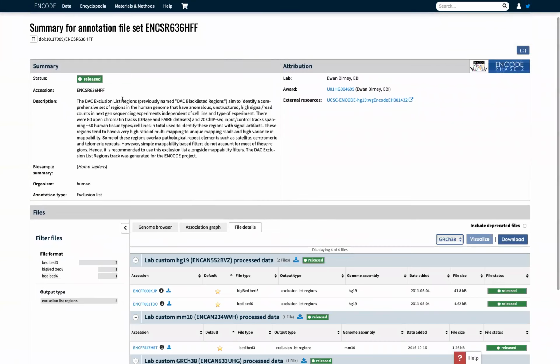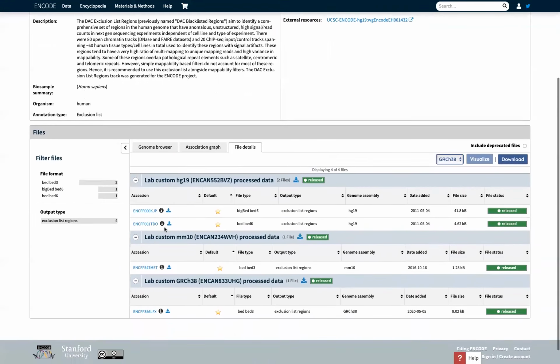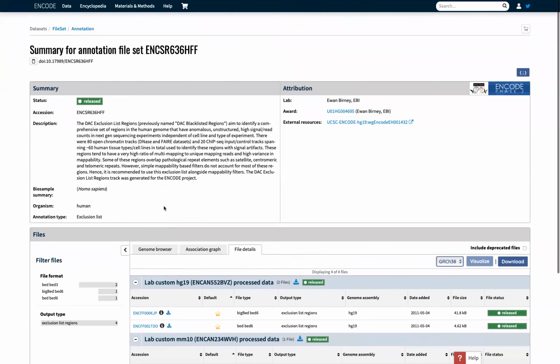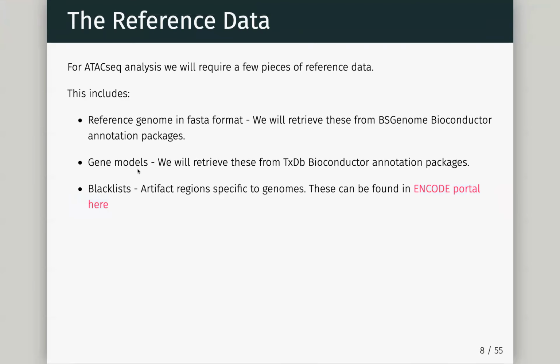Okay. So I did a lot of work with these actually in my first years as a bioinformatician because I was very big on ChIP-seq, my speciality. We wrote a little paper on this too. And really it was a fantastic piece of work by a number of labs, but Anshul Kundaje, I think we can probably say, was the guy who really put it all together. And what they did is fascinating, and we can actually see it better in the ChIP-seq.